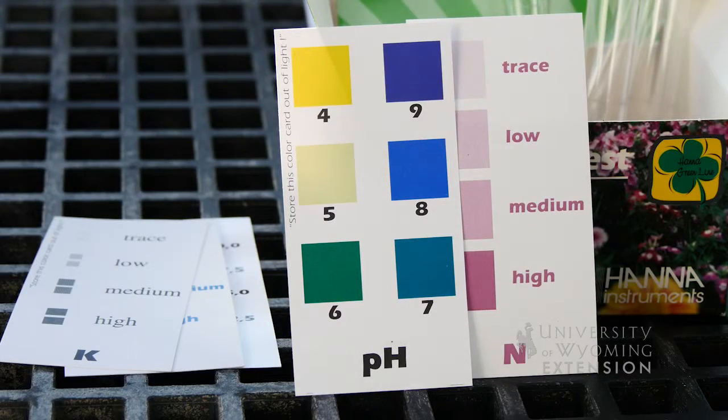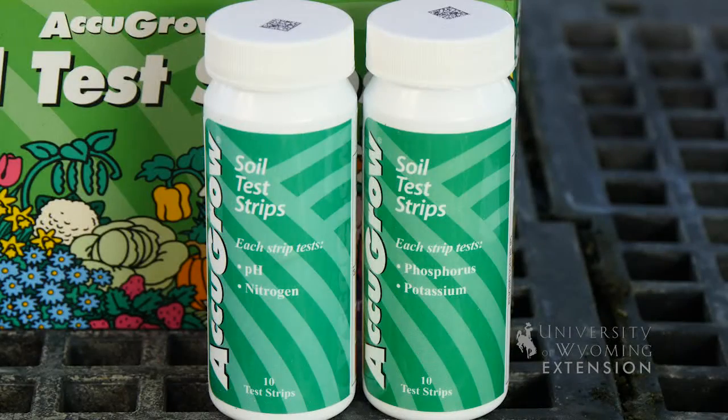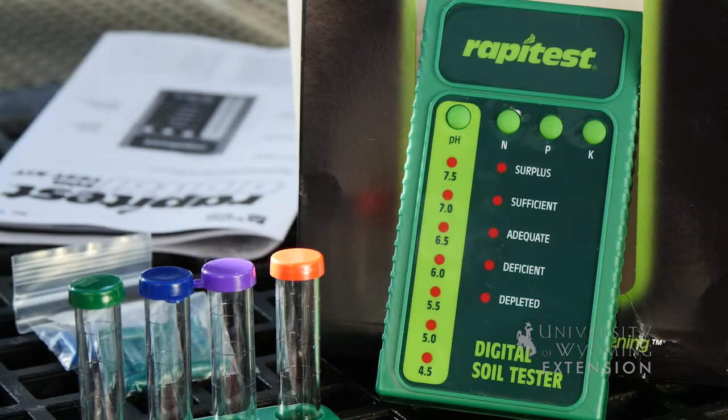For the pH test you'll match it to the pH card, and there are also tests for phosphorus, nitrogen, and potassium. It's a pretty simple kit — just put the reagents, water, and soil into the tube and match the color.